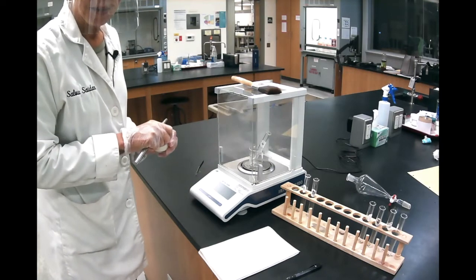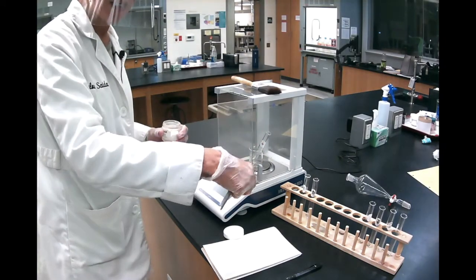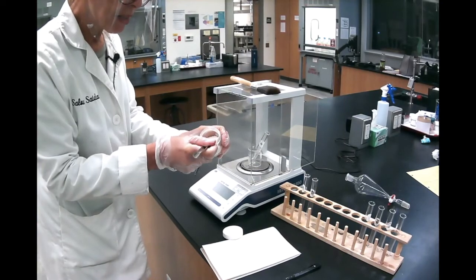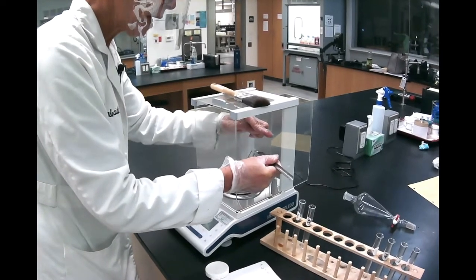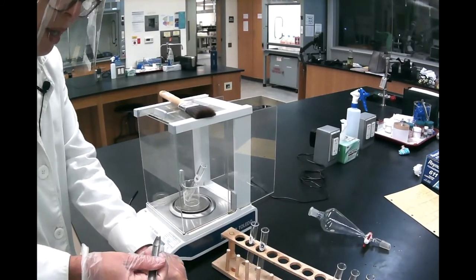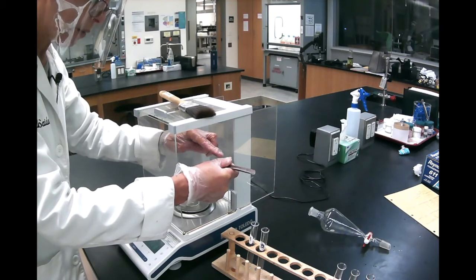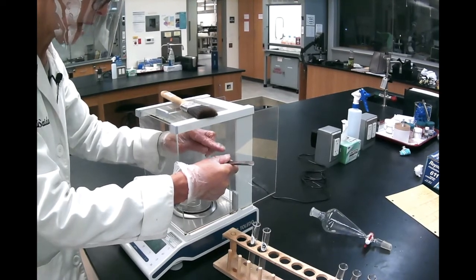Now I want to add 100 milligrams. So how do you do it? You don't take it out and put it back in, or you put too much and remove. We never do that. So we always work this way. You take a tiny bit on the tip of your spatula, and then you go inside, and I'm going to keep tapping. So I know I want 100 milligrams, so I went from 44.4, I want to take it to 44.5. So all you do is kind of tap on the spatula to allow the powder to go down very slowly, one little piece at a time.